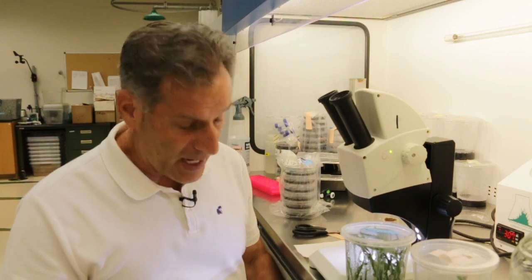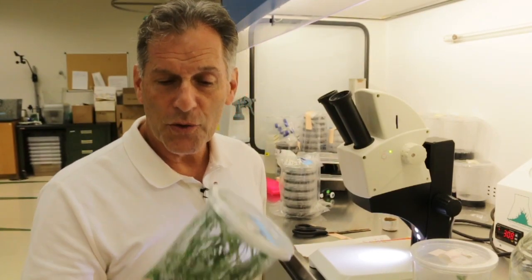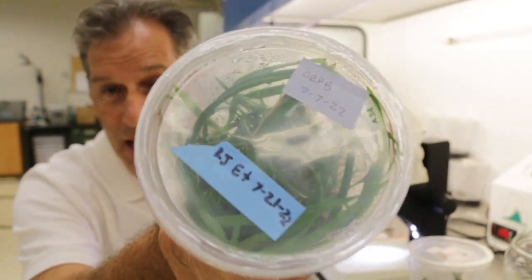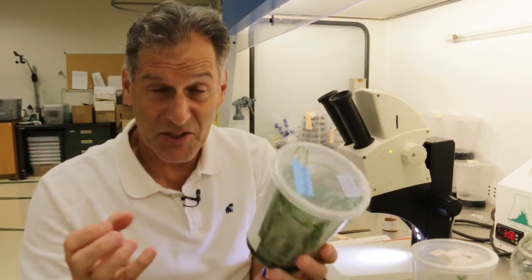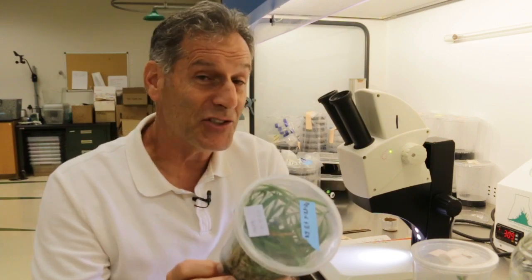As far as growing orchids as plants in your collection, that's a slow process — it really takes a long time to get a seedling to flower. My approach is to get bigger seedlings in flasks so you take them out and you've got a head start on things. This is a flask of Encyclia tampensis, and as you can see it's pretty much loaded — the roots are growing well, the plants are up to the top and hitting the top of the container, and these are huge plants.